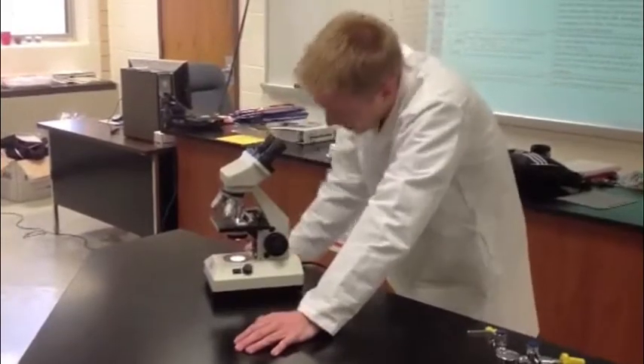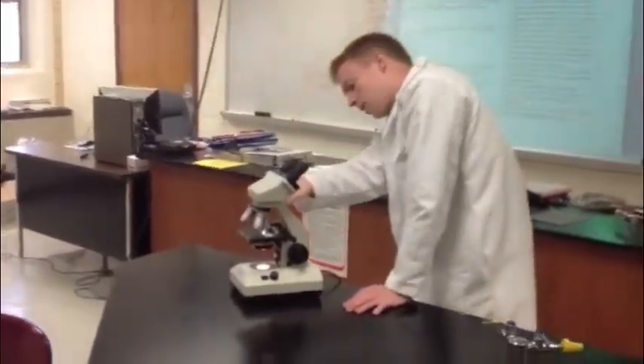I can't see anything. Mr. Pepper, I'm trying to look at this really high-powered lens, but it's all blurry. Well, you're not going to see anything. The really high-powered lens is actually the oil immersion lens, and we really only use that when the specimens have oil on them. Most of the time in honors bio, we'll rarely, if ever, use this lens.